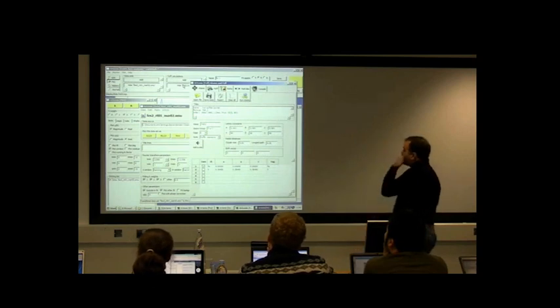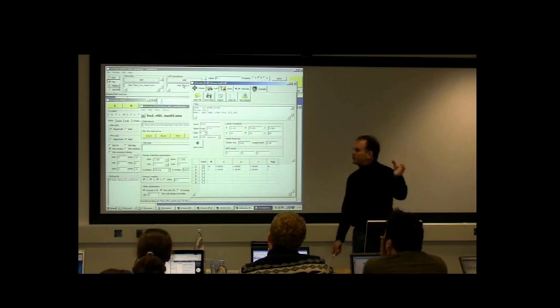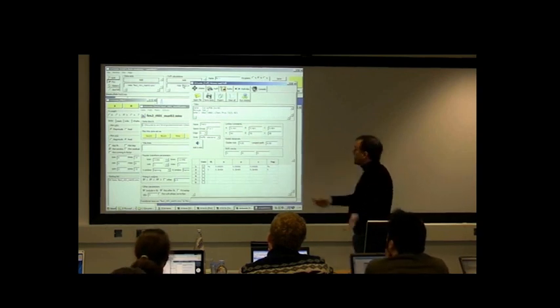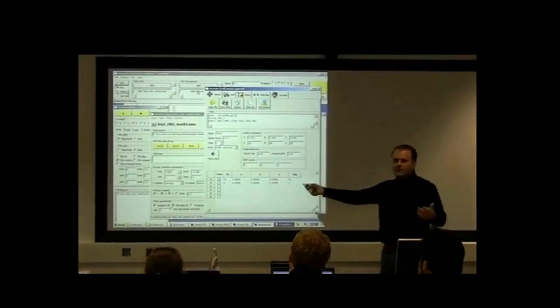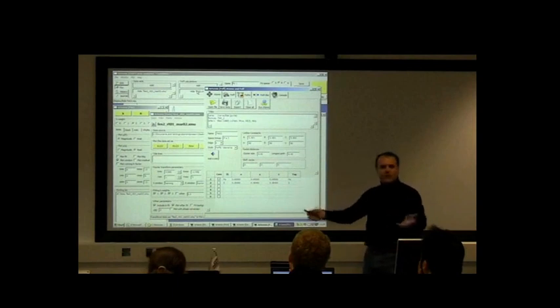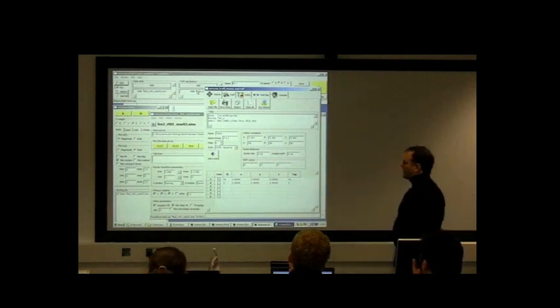Now, what's been imported from that little file that had crystal data in it is the results of a crystallography refinement. So we have a space group, and hopefully at least some of you in the room are at least passingly familiar with how this crystallography stuff works.